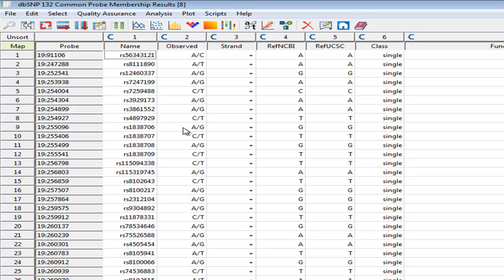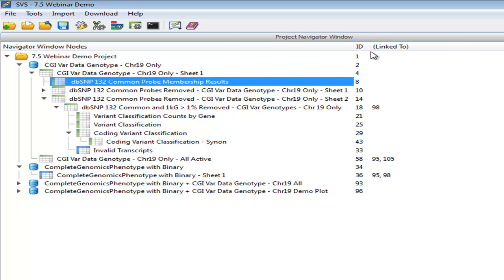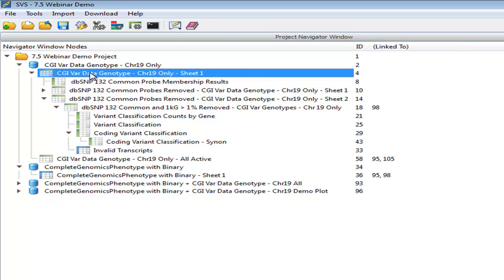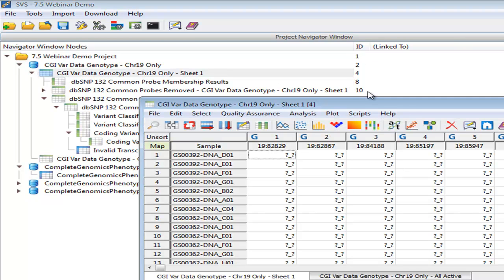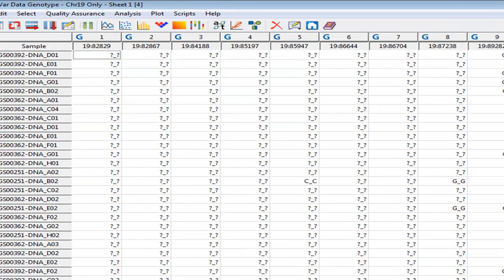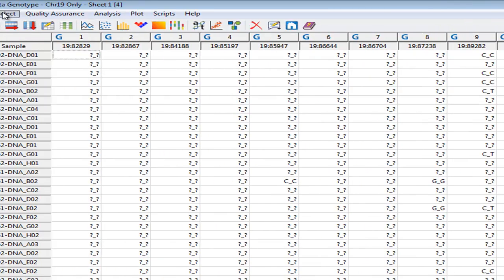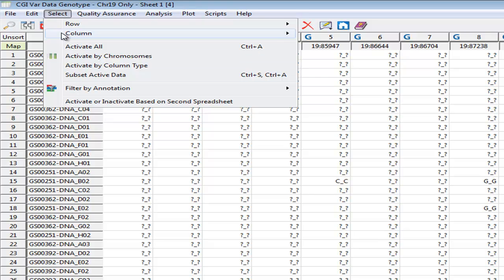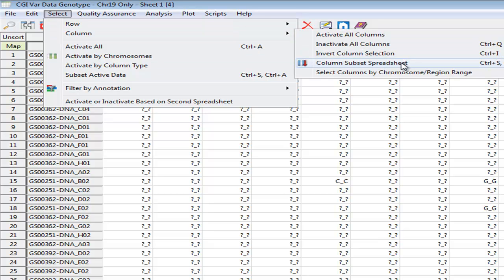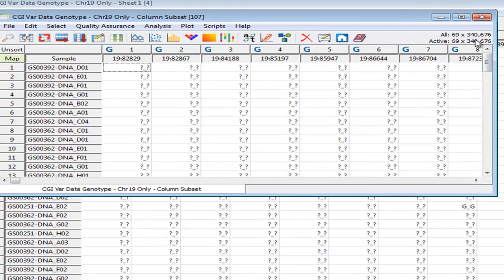As you will see later, we'll be doing another filter and there will be a different set of columns, and we could even do some analysis based on these columns and further filtering. But in this case, we found 213,000, and I've already used this 213,000 to create a subset spreadsheet that has removed those. And just to show you what that looks like, when I go to our original spreadsheet, we have the 550,000 we started with. We've lost those 230, so now they're already inactive, and you can see them inactive. We can go to Select, Column, Column Subset Spreadsheet. And now our spreadsheet contains only those 340,000 remaining variants that were not found in dbSNP132 common.